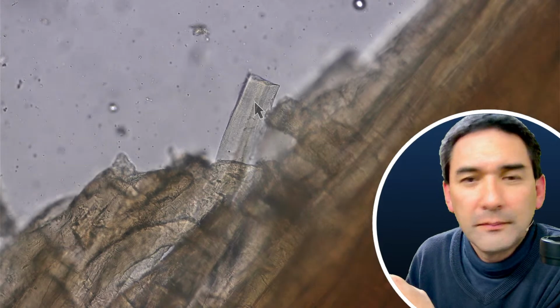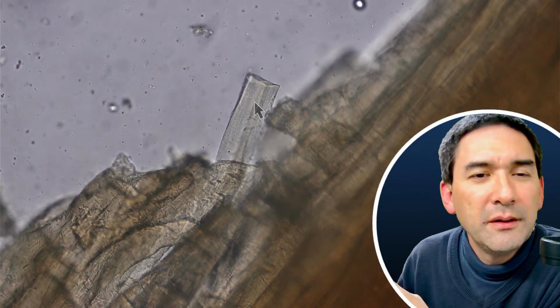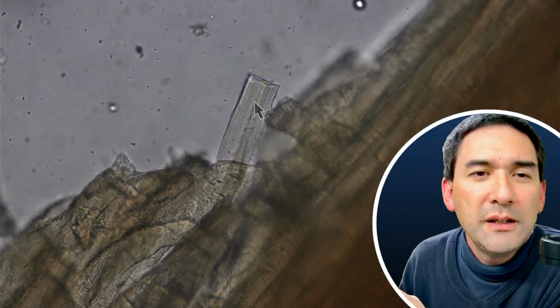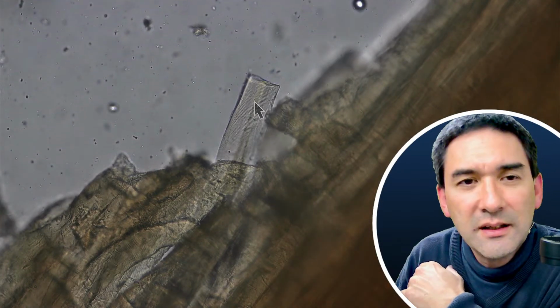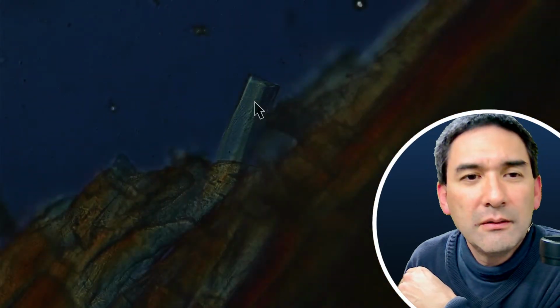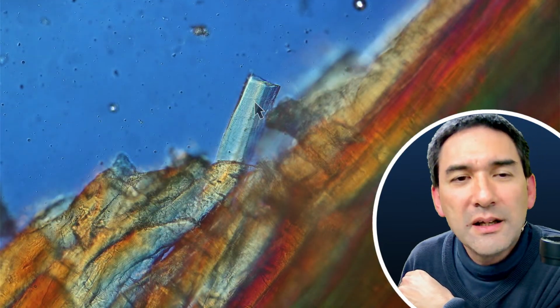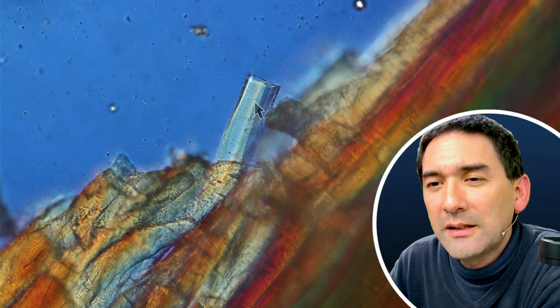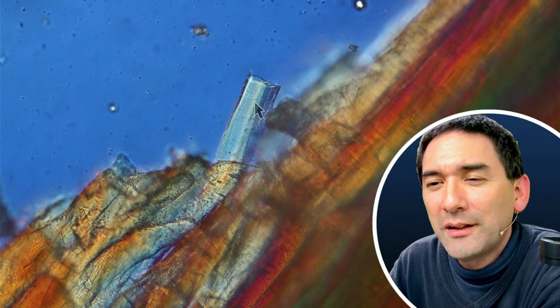Yeah. I can close a little bit the field diaphragm. Okay. So these are basically the natural colors. You can still see the striations, and this is basically a DIC, which is a little more colorful. So, okay, at least I was able to show you that.